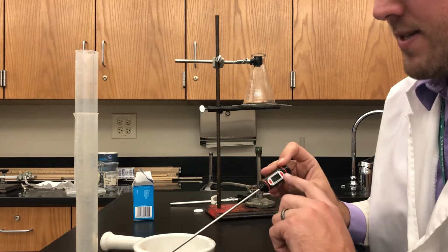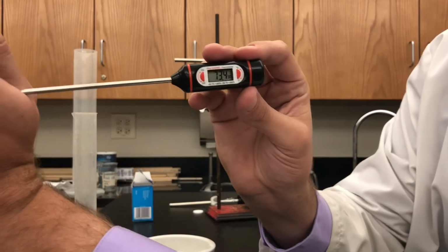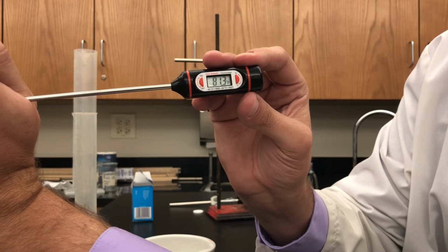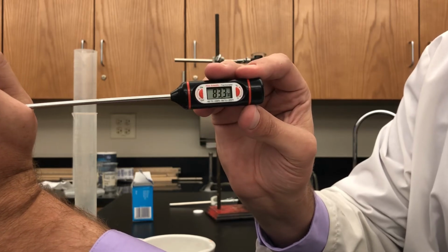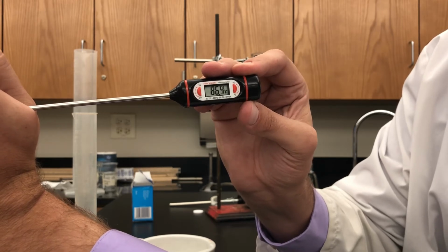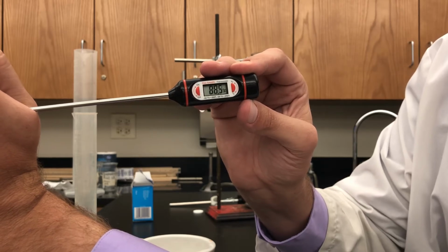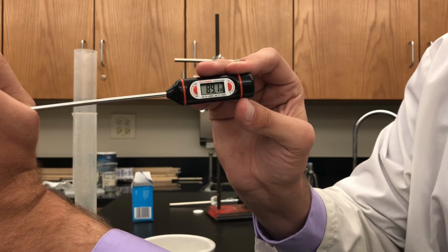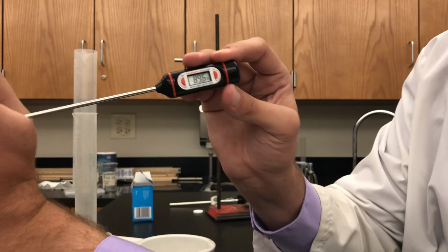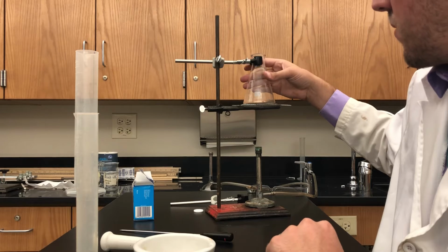I'll talk about a note about the stabilization really quickly. You'll notice that this is not an instantaneous thermometer. What I mean by that is I'm putting my hand on there. You notice the temperature keeps on going up and up and up. You do not want to record or write down that temperature until it actually stabilizes, until it reaches a point where it's no longer oscillating, going up, going down, until it's just reached a pretty steady temperature. So obviously, for my hand, it should get somewhere in the 90s. So you'd want to wait until it gets to that point before you write that down.